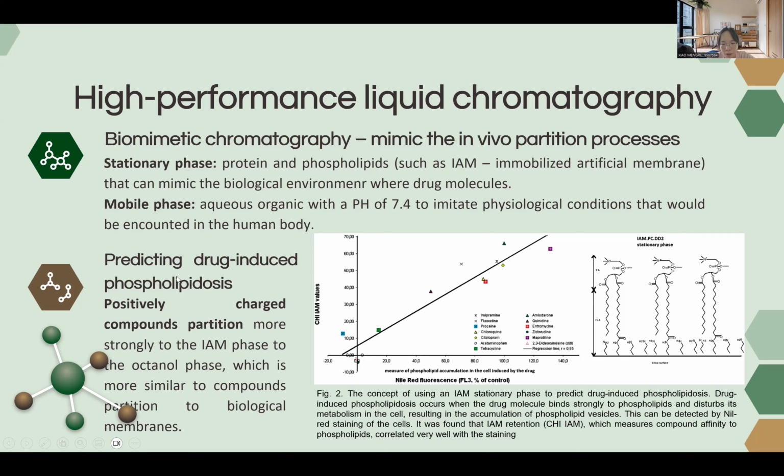Through this, using the new biomimetic stationary phase to predict drug-induced phospholipidosis, by immobilizing various phospholipids on a stationary phase, providing an intermediate step between in silico and more complex in vitro assays.